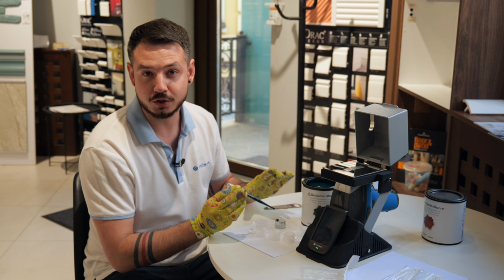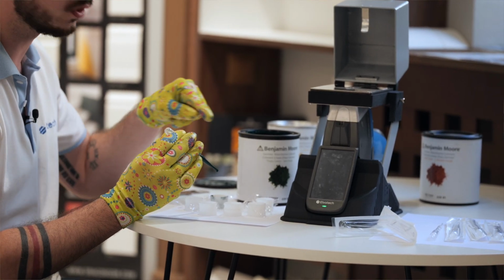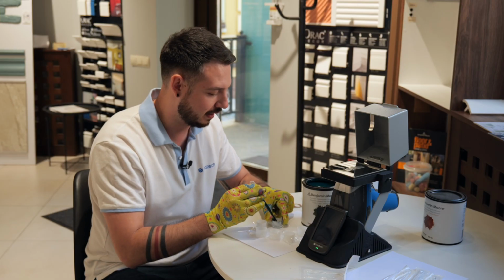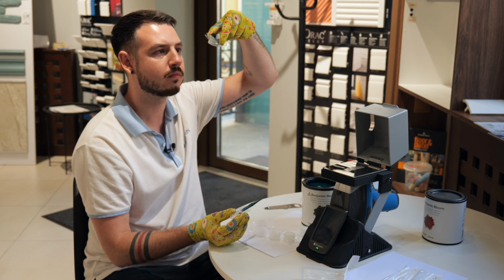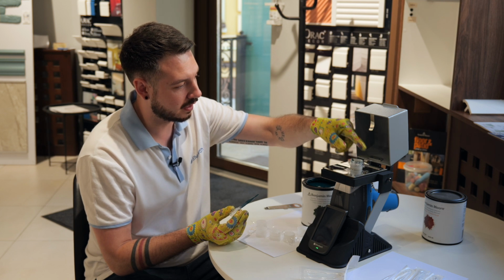So we don't need to pour a lot of the paint, just a few millimeters to cover all the measurement area of the cup. Then we check it for any leaks again. Everything looks good and we can start our analysis.